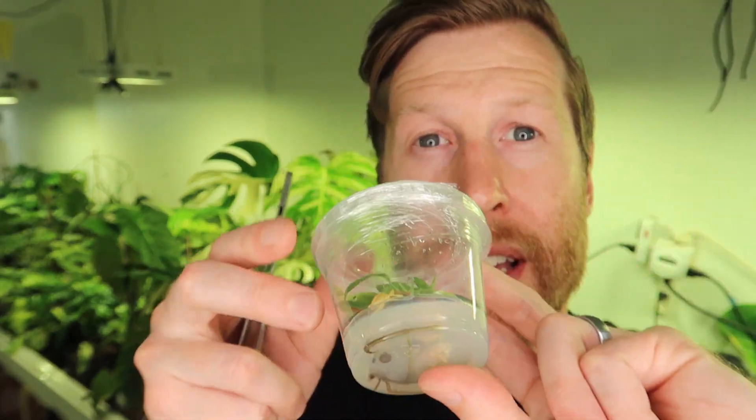This is heartleaf variegata that I tissue cultured myself. I've been playing with the process of micropropagation a bit, and I'm going to unwrap this now. This is a sterile container and you can see there is no contamination on my agar — that's the jelly in which the tissue culture sits.